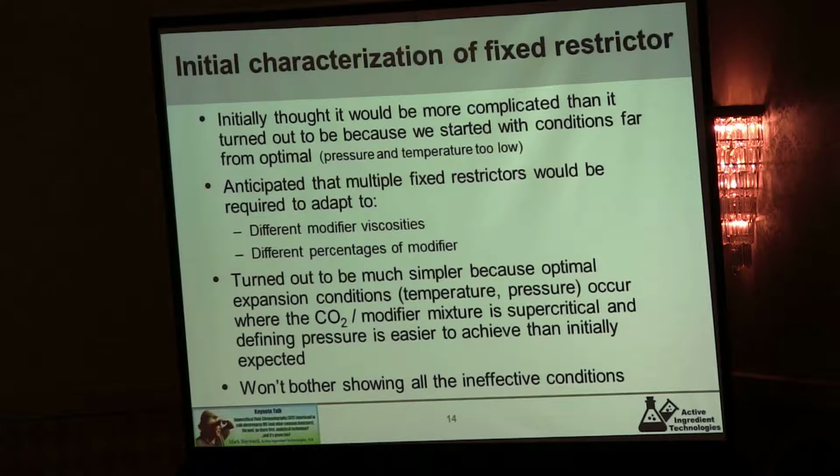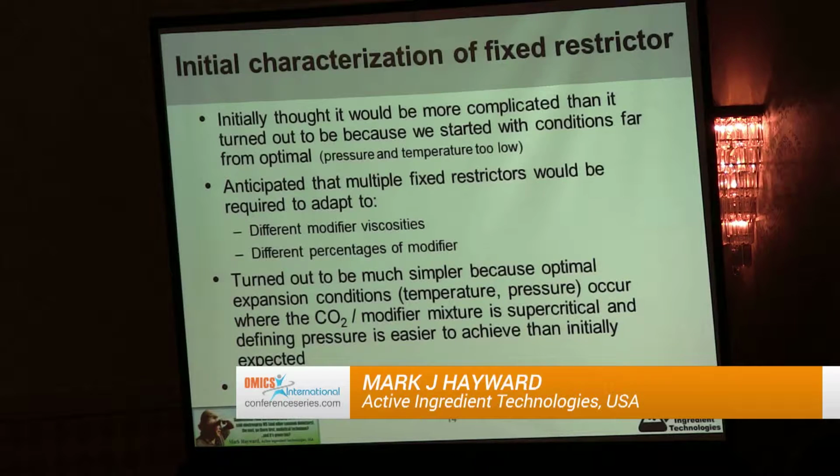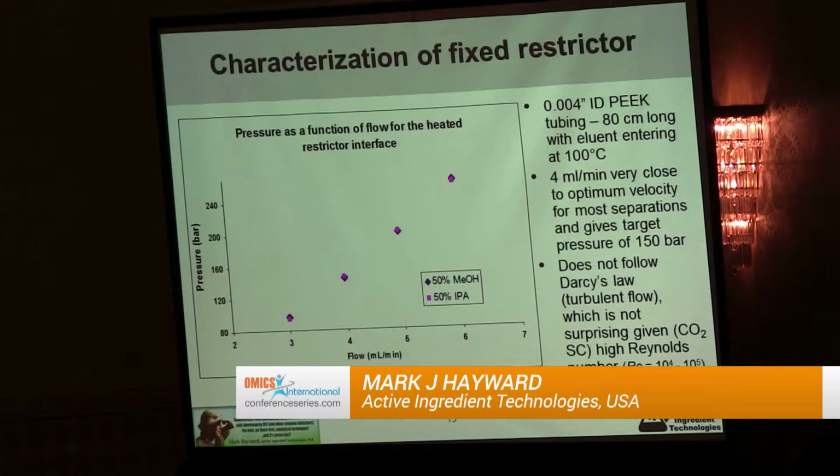once we've heated things up before entering the restrictor, we're 100% supercritical, so things really don't change. It doesn't really matter what the solvent composition is so much. You get the same back pressure and outcome with one apparatus.